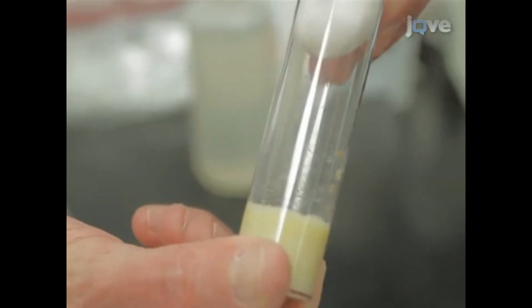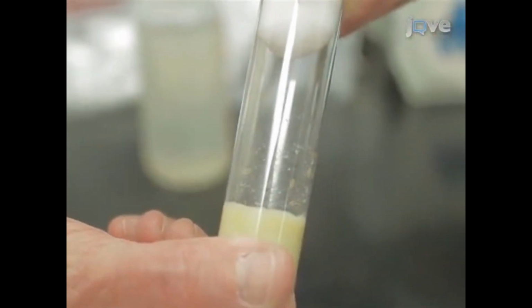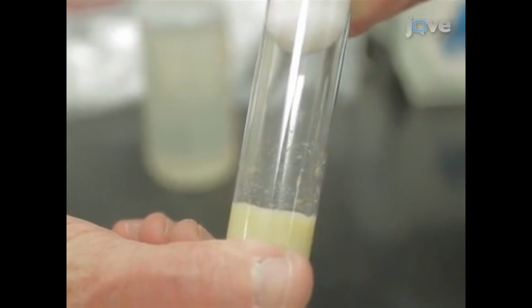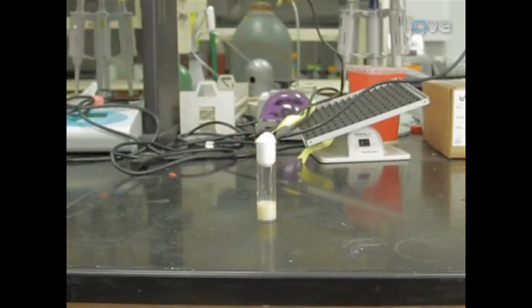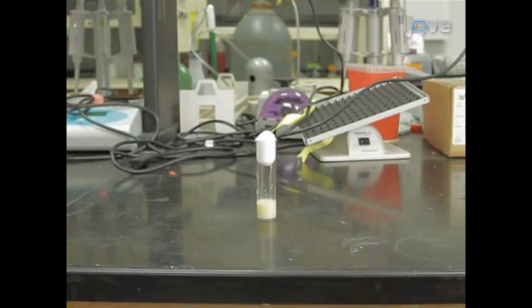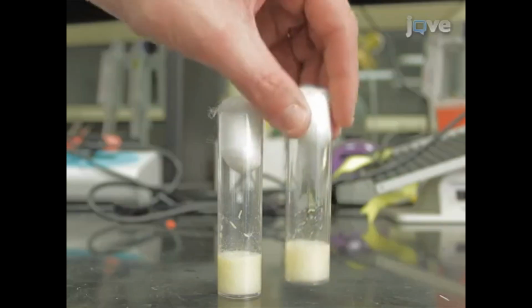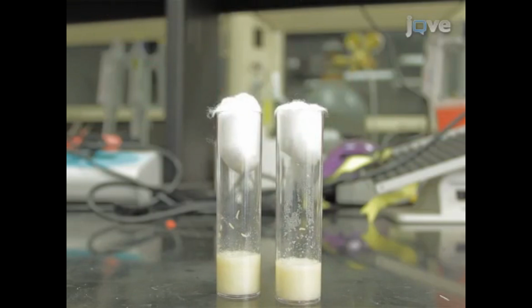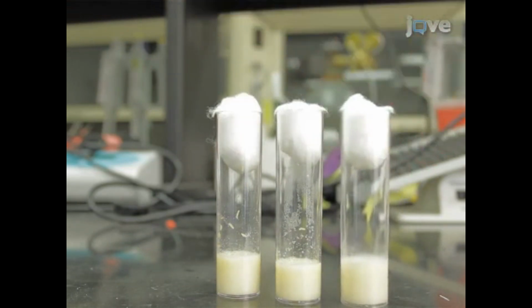When the oldest cohort reaches the wandering stage, it is time to apply the diet manipulation by removing the larvae from the food. At this point, larvae in the oldest cohort are well beyond the minimal viable weight for eclosion and will be near the natural maximal body size. Larvae in the intermediate cohort have exceeded the minimal viable weight, but will produce smaller adults than larvae from the oldest cohort. Larvae in the youngest cohort are very close to the minimal viable weight, and thus will produce very small adults.